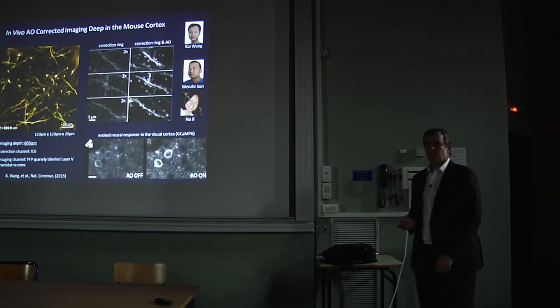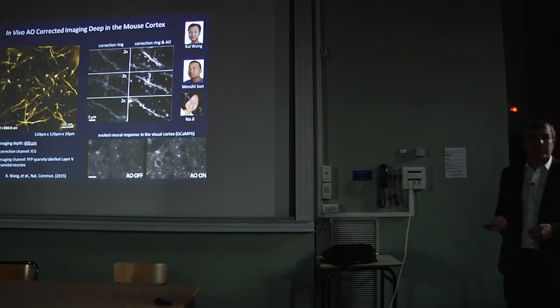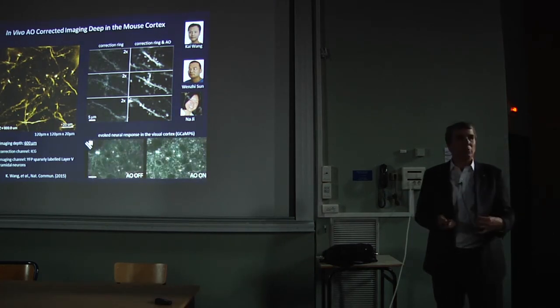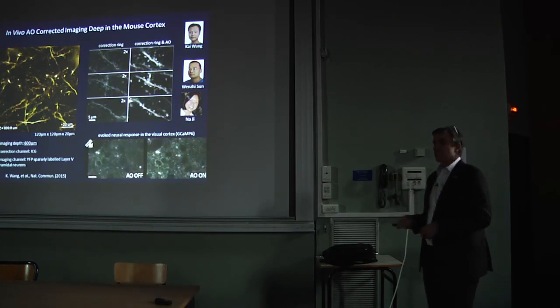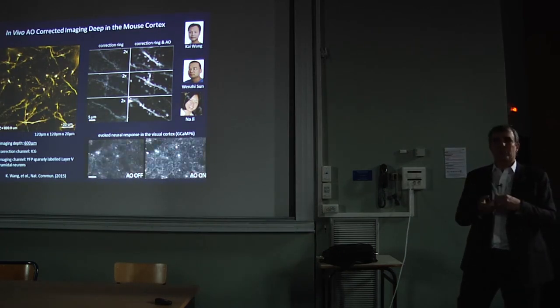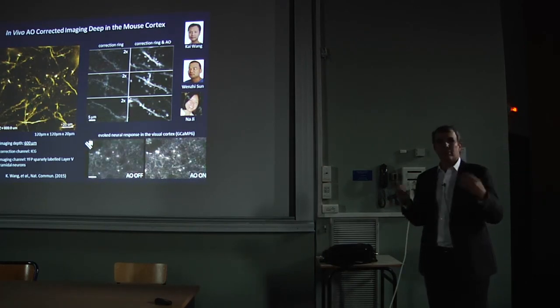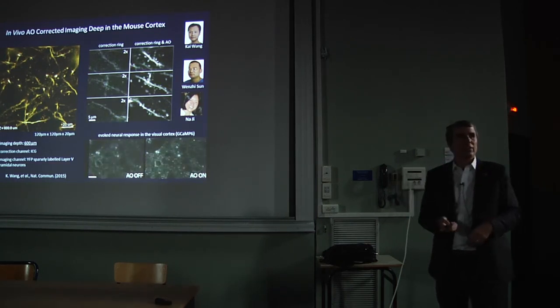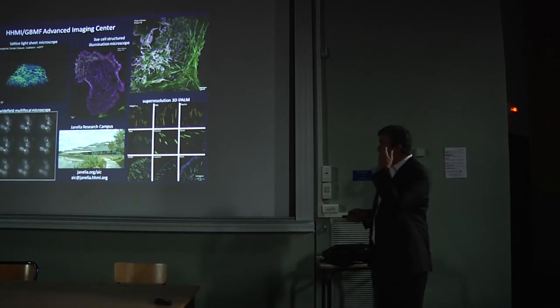And then a great improvement, particularly when you're doing functional imaging of neural activity by these genetically encoded calcium indicators. This is something that my wife, who's also a pioneer in this adaptive optics, uses in her work as a neuroscientist to be able to understand how the inputs from the thalamus are computed by neural circuits in the deeper levels of the mouse cortex to generate directional sensitivity to threats from different directions that the mouse sees. So that's pretty much all I have to say.